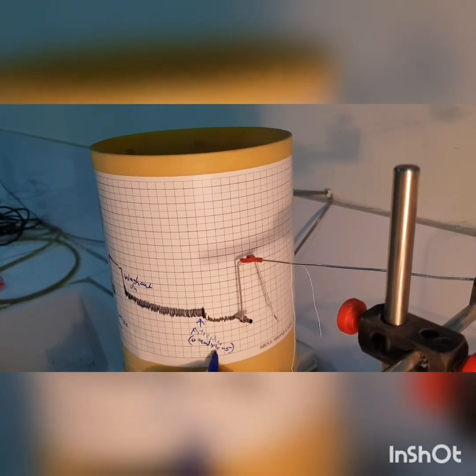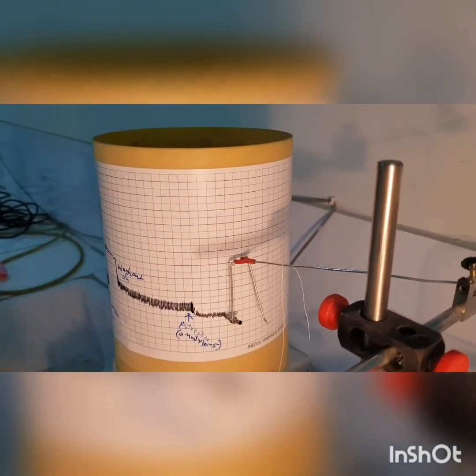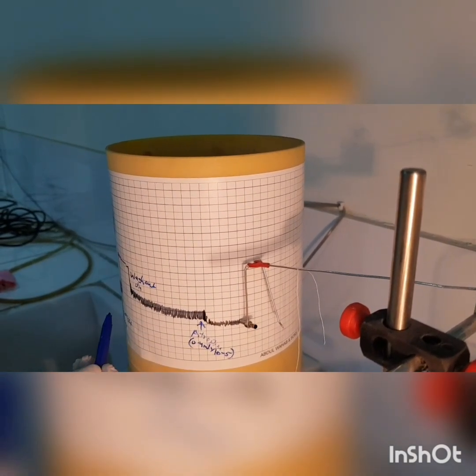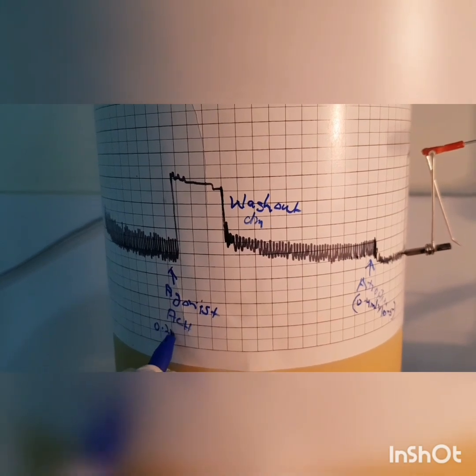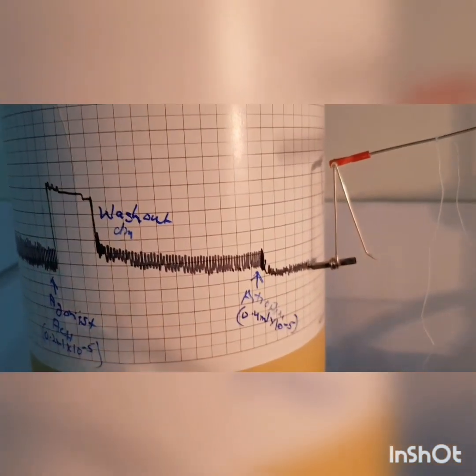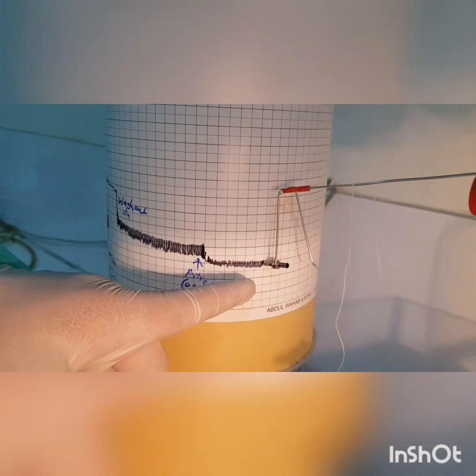Remember, this 0.4 ml is equal to 4 microgram, and here the 0.2 ml is equal to 2 microgram. This is the effect of the antagonist.